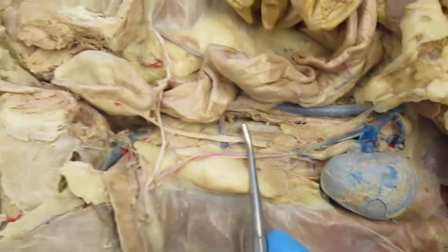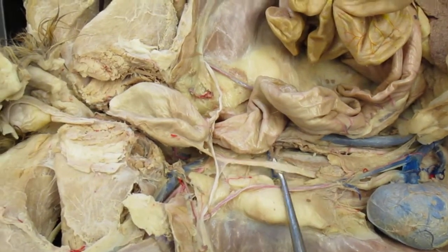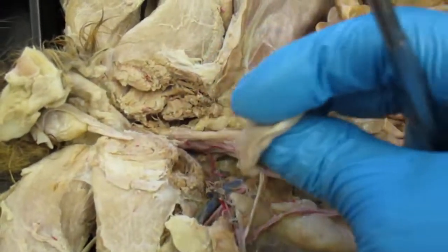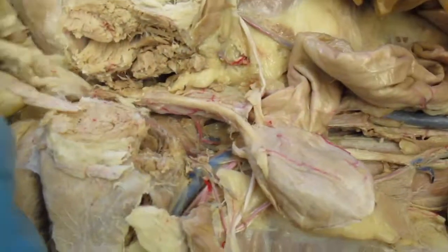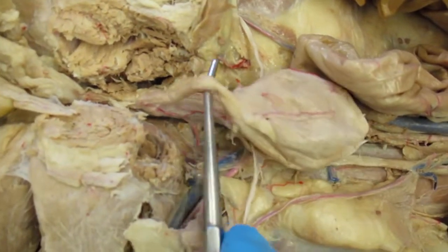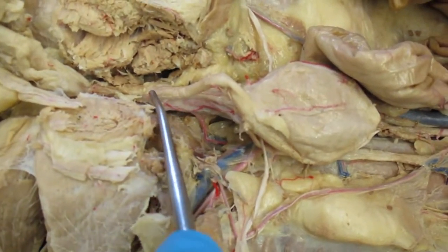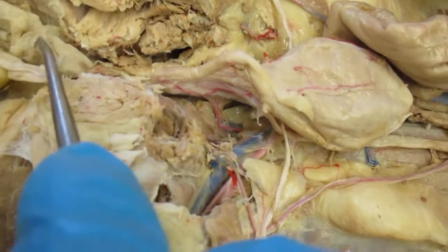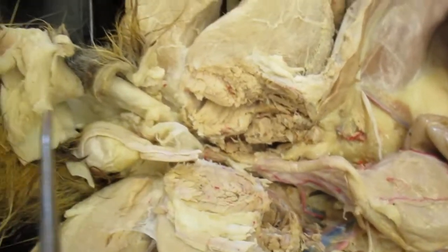This is your ureter right here, which is going to connect to the bladder right here. And then we have the urethra right here. And then we can see the urethra going down, and we see the penis right here.